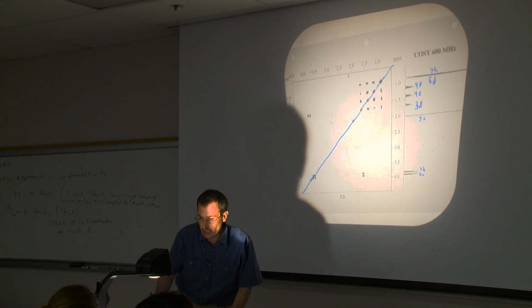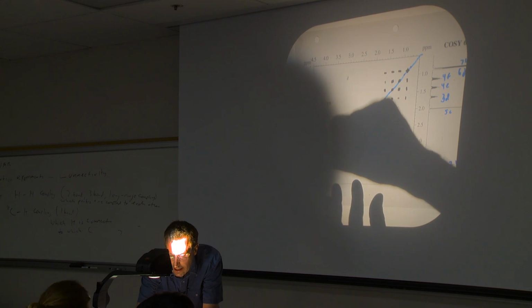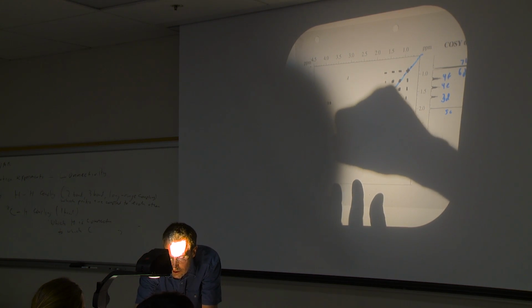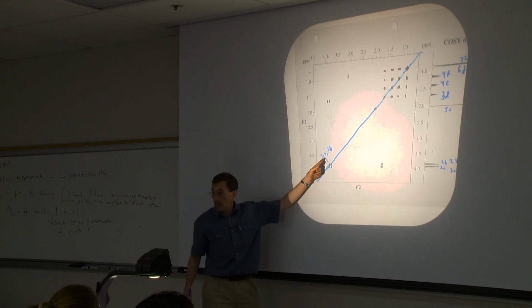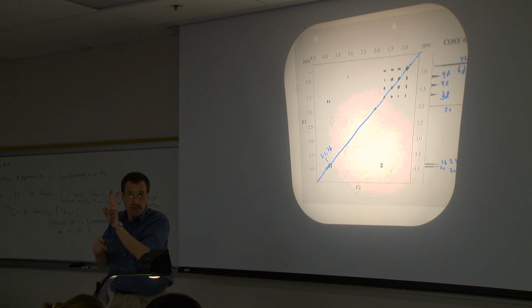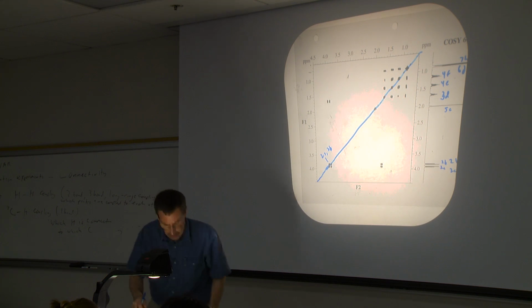We see that our 2B, that's 2B over here, and that's 2A, cross with each other. Well, that's not really providing us any new information. We know we're trying to build up the framework of the molecule. We know that those two diastereotopic hydrogens, A and B, are attached to carbon 2 and that they're going to couple to each other.